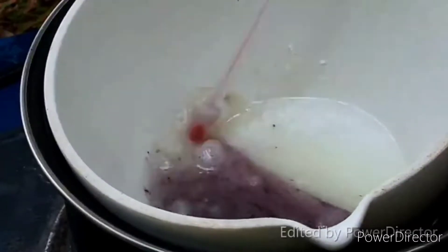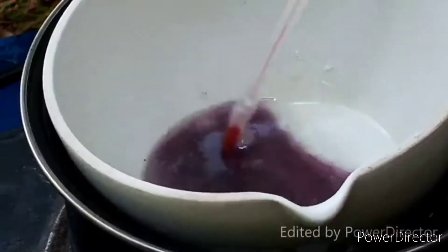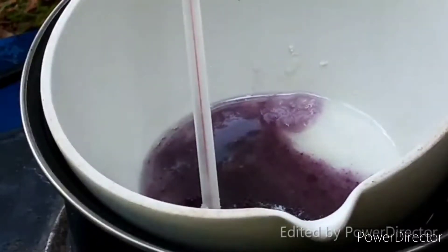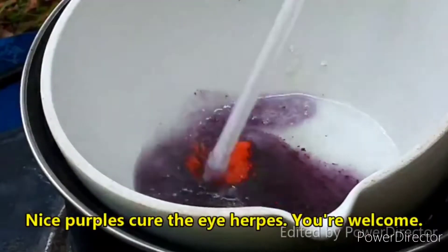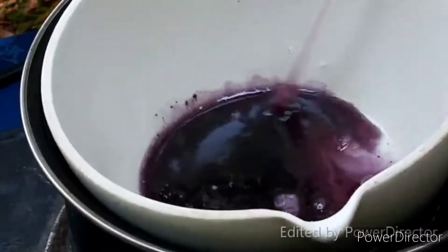That's a very nice color — nice and purple. Melt, you little chunks. That smells like some kind of poisoning.